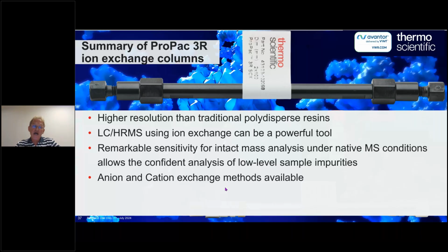And you can do it with the anion exchange and the cation exchange. Most people have concentrated on cation exchange because of monoclonal antibodies, but now you're seeing a lot more fusion proteins coming out which are anionic, and as soon as you start getting heterogeneous glycans and sialylation on there, it's the anion exchange that's going to help. And if you get it out in one lump on a size exclusion column, you'd never deconvolute the mess you've got underneath that peak. But once you start separating these out into different variants, now you've got something you can actually use.